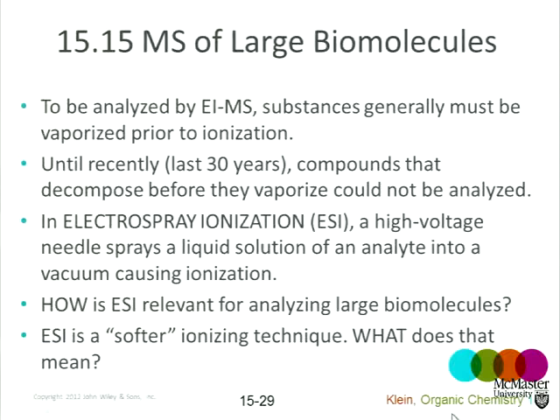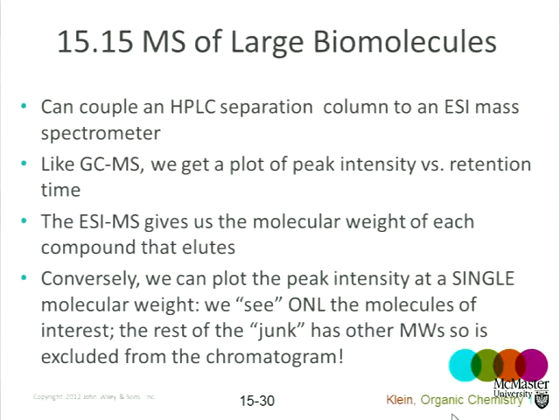ESI is a softer technique, which is also useful because soft ionization techniques don't leave excess energy in the molecule to cause fragmentation. And so with very large biomolecules, fragmentation would be an issue if we used hard ionization techniques.